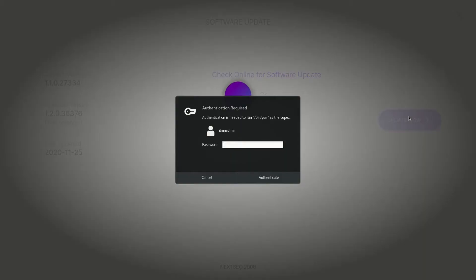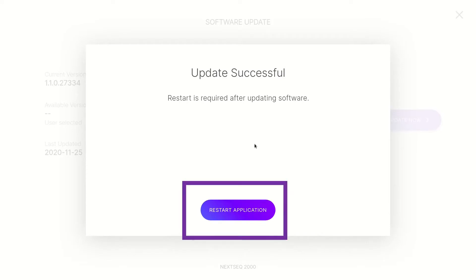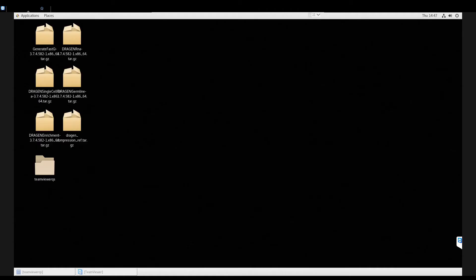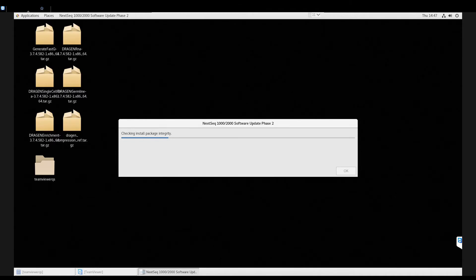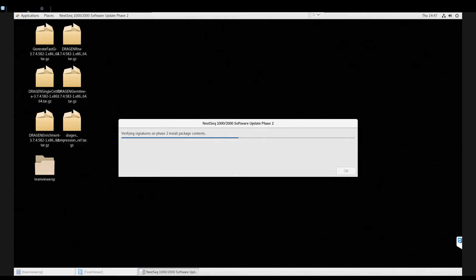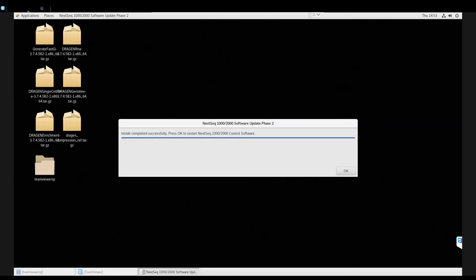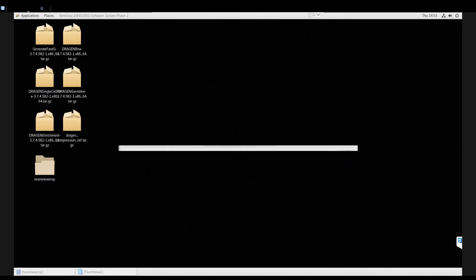Select Update Now to start installation. If an authentication required box appears, type in your Illumina Admin password and select Authenticate. If successful, the control software displays a busy indicator during installation. Once complete, select Restart Application. An installer progress bar appears with the status of the update and a notice for Dragon workflow installers. Choose OK to dismiss. If an authentication required box appears, type in your Illumina Admin password and select Authenticate. After the install is completed successfully, click OK.